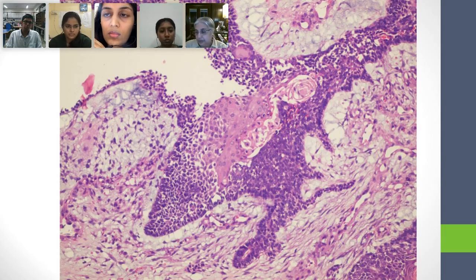All right. Now, you used the term dysplasia, and you used it the last time as well. Will you tell me what you mean by dysplasia? Ma'am, dysplasia is disorganized growth. So we will have two components: one is architectural distortion, and the second is cellular atypia.